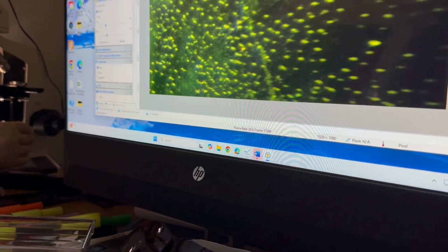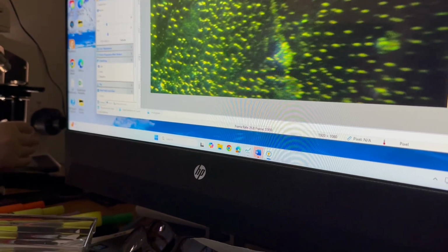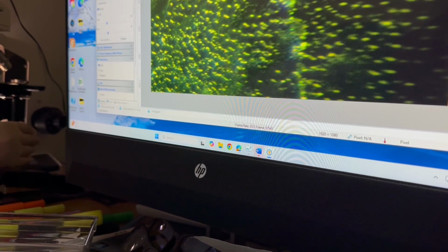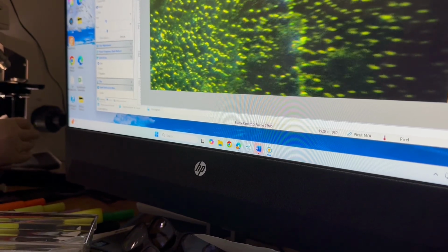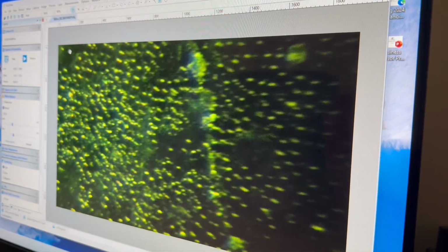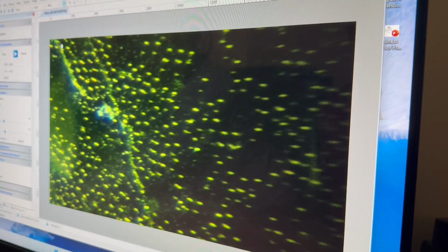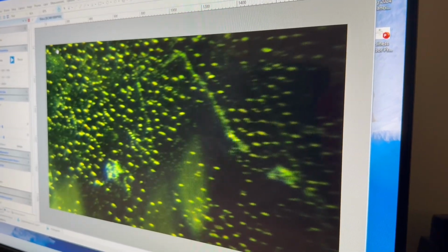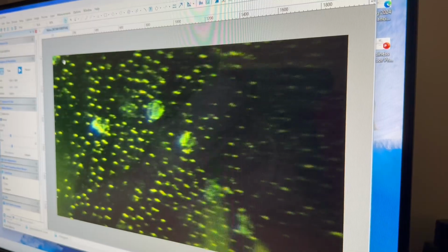It's trying to eat it. There's another white blood cell doing the same thing. Look, there you can see it doing its thing. There's another one. So when I go down and I'm seeing right along that line, the body's fighting something, doing its job, and it sees it. Versus this one's over here all by itself. My medication must be doing. And then there's these ones here.